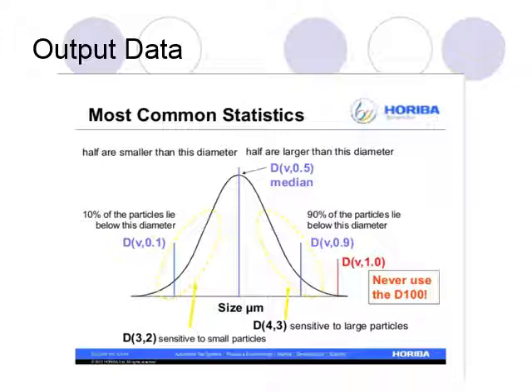If you believe any measurement can tell you that everything is less than this, then you'd have to really have faith or take enough measurements to feel safe using that value. And you really wouldn't want to do that. You'd be better off taking multiple measurements and using D90 data or D95, which you can statistically go through. At D100 or D99, a single bubble of a certain size would be enough for the system to say that's your large particle. So that's just something to think about.